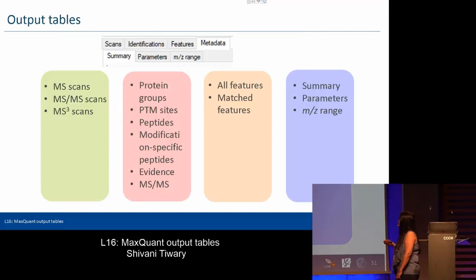And so this is the summary. You have your 4 levels, and you have different tables. We have to know that each table is also linked to each other. So you can find the identifier for each table, and then you can use this identifier in another table, match them in Perseus, and use the information from each other table.